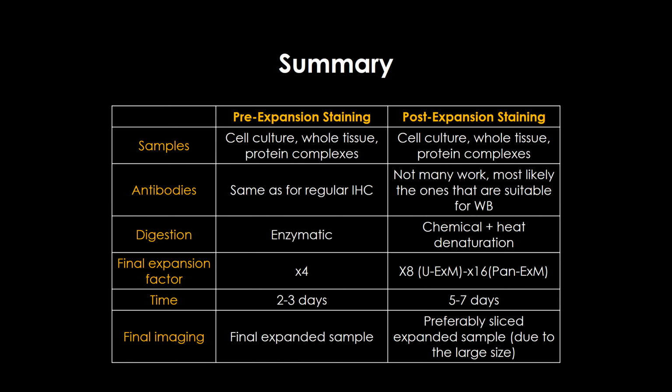The time: the pre-expansion staining is less time consuming, it's only 2 to 3 days, while post-expansion staining takes longer, especially the ultrastructural expansion, especially the pan expansion protocol, which takes longer.